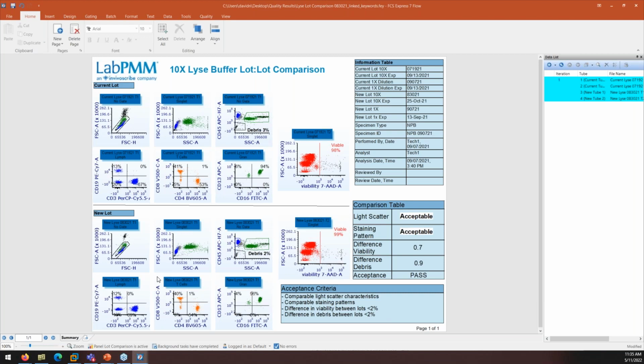And you can see that it populated. There are 2 tubes. Even though there are 2 tubes, each tube knows what plots it's supposed to go to. And again, here are the acceptance criteria clearly documented within the validation document itself. Here a whole bunch of metadata came up, either hand typed in or pulled up from the metadata in the FCS file itself.